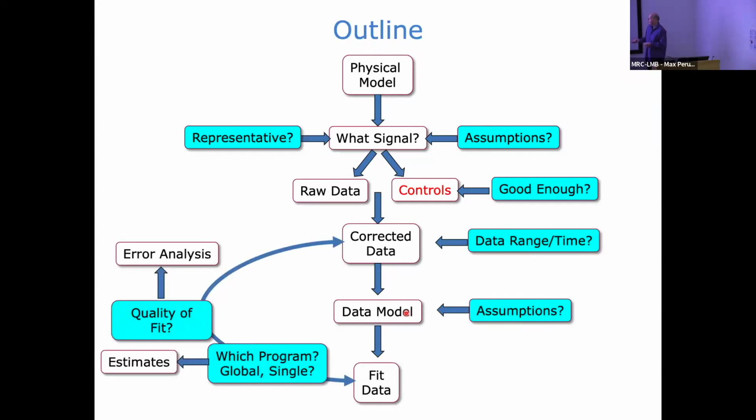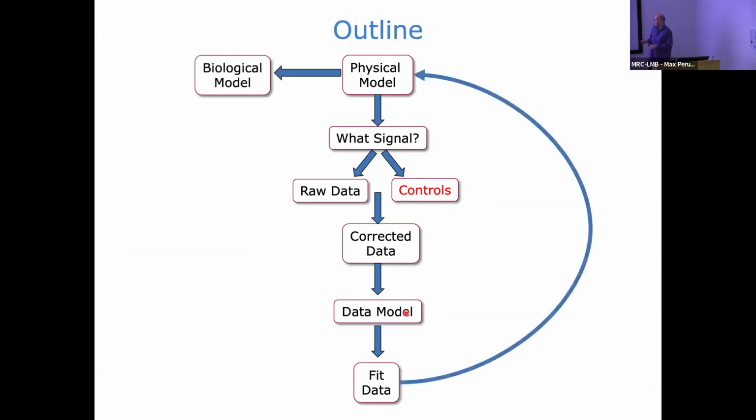You're going to have a data model. You're going to fit onto that data. What are the assumptions in that? What program are you going to use? What are your estimates? How are you going to estimate the quality of fit? And then hopefully after all that, you get some nice data that reports back to the physical model, which is then going to inform what's going on in biology.